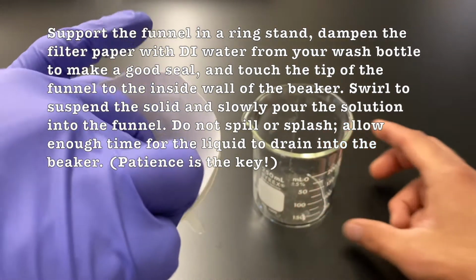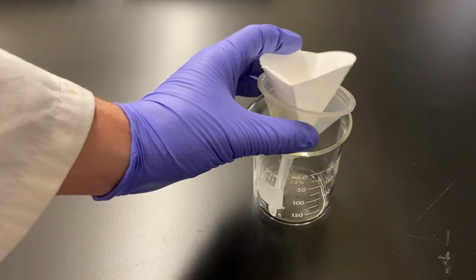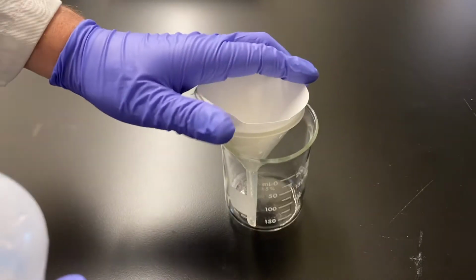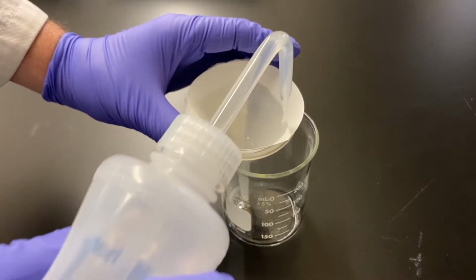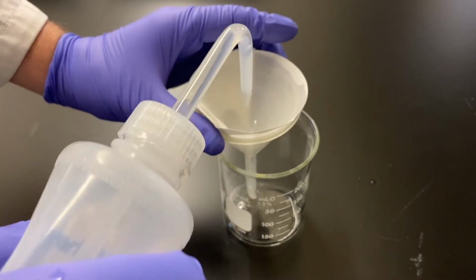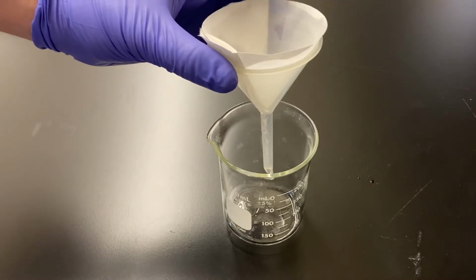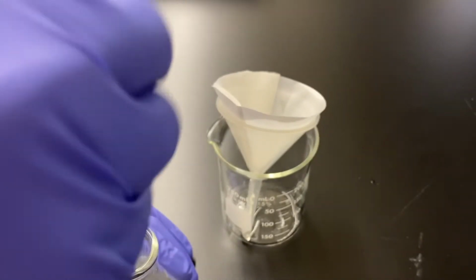So here is our funnel. We're going to put our filter paper in the funnel. So we're going to put our solution through that. Again, the salt is dissolved in the water, so as the water goes down, the salt will come with it. And our calcium carbonate as well as our sand will stay in that filter paper. You'll notice I wetted it before we add anything. That gives a nice seal before we add our actual solution.